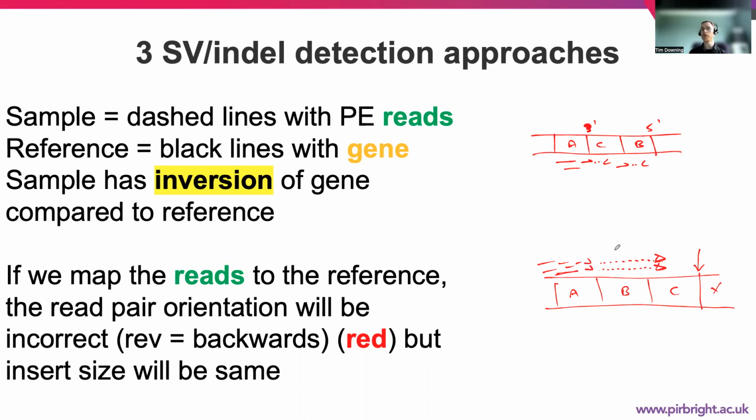So this reverse read is going to be pointed in that direction as well. And the other one at the 5' end of C, so that's the 5' end of C here, that one will be in a different orientation as well. So we'll also see reads that have an odd orientation.